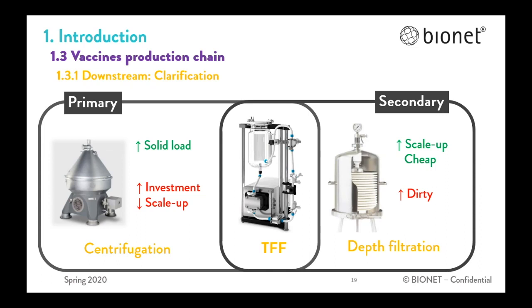TFF, however, is linearly scalable. It can face a high solid load, and the membranes are reusable after cleaning, so it can be implemented for both primary and secondary clarification.